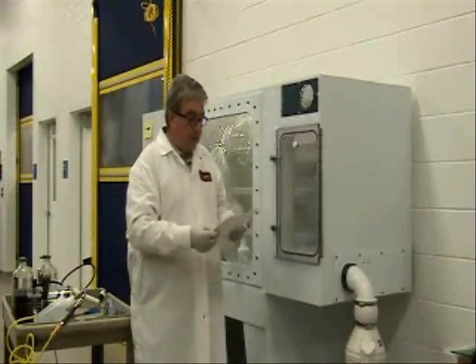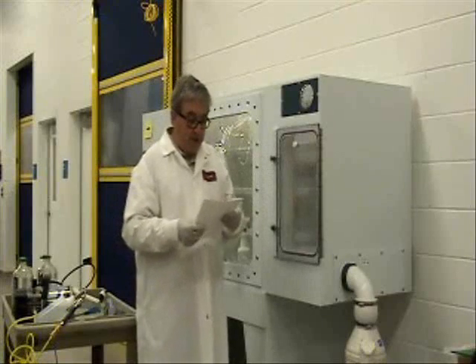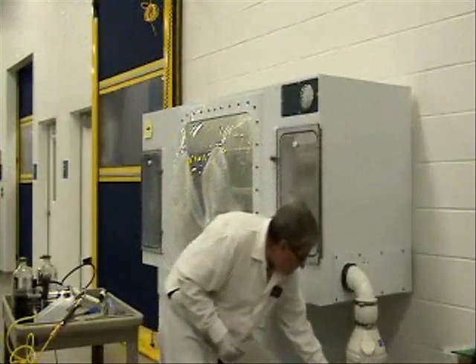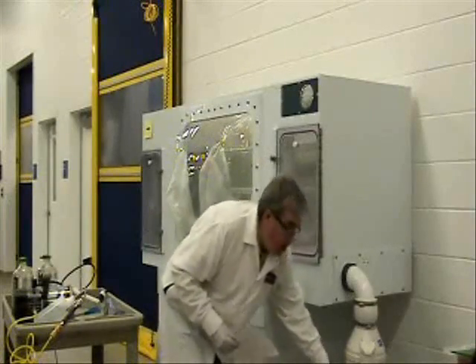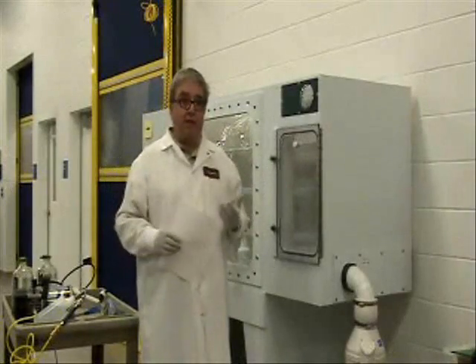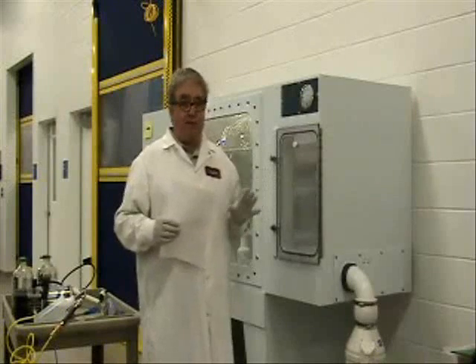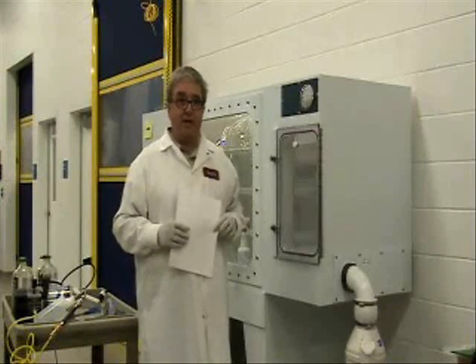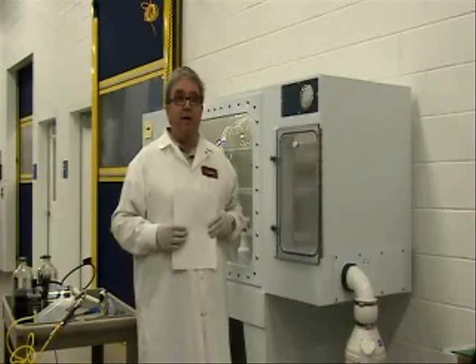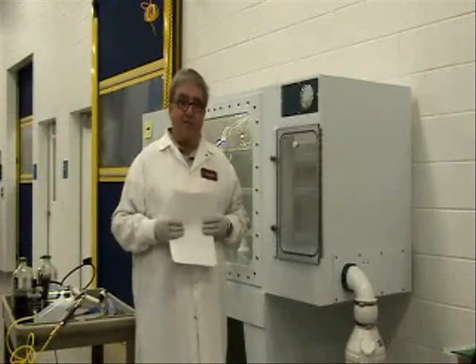Now that we assume the isolator is completely misted, we're going to turn the blower on for 15 minutes in the positive direction. This allows the mist to circulate throughout the isolator and come out the exhaust filter, sterilizing the exhaust filter. The range is anywhere from 15 to 30 minutes, and it's really a facility-specific determination. If you're starting with a clean, brand-new filter, perhaps 15 minutes would be enough.